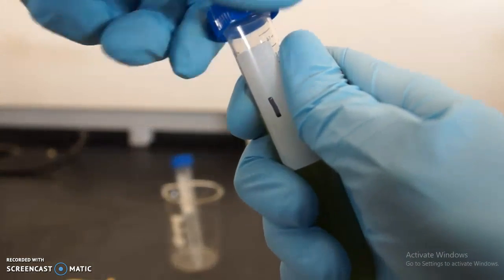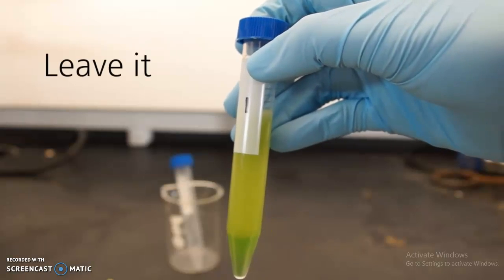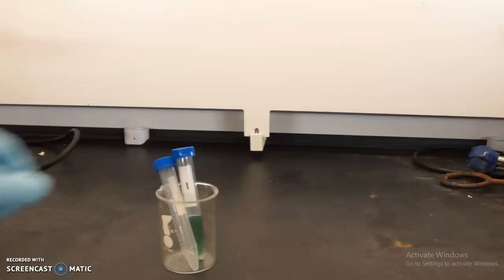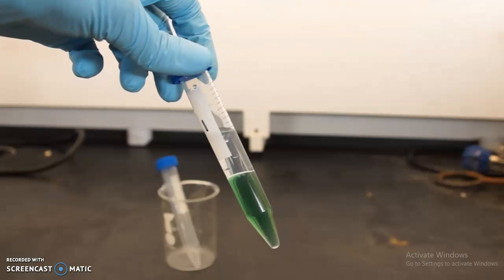If you don't want to shake, you can use what we call a vortex mixer. When you're done, let the Falcon tube sit still to allow the layers to separate completely. If you want to separate these two layers, you can use a centrifuge machine. We have it inside the forensic practical lab.